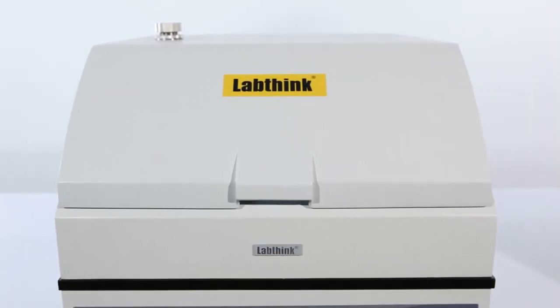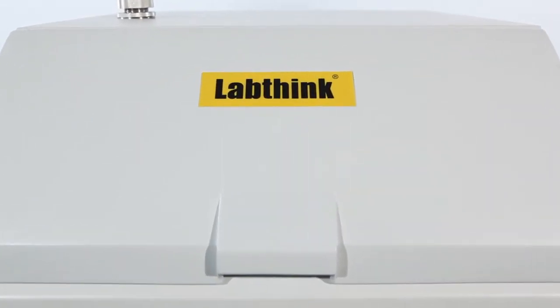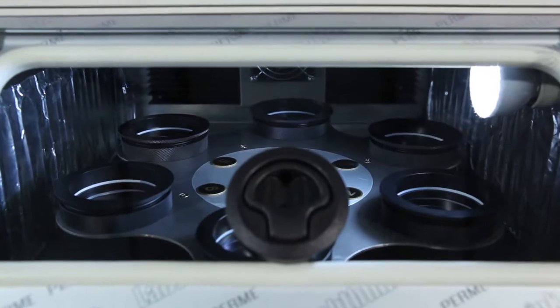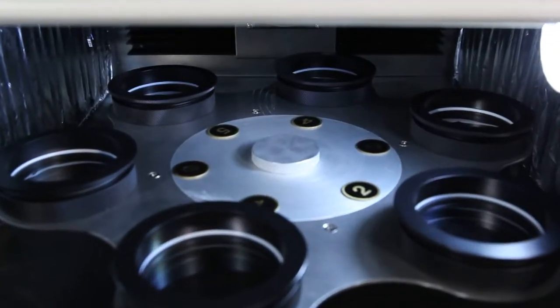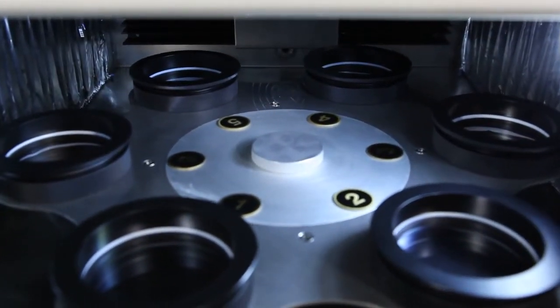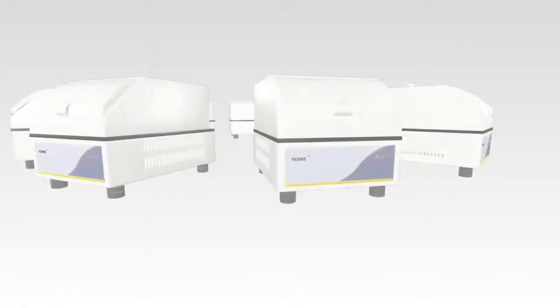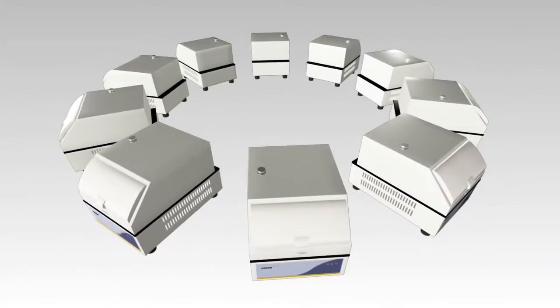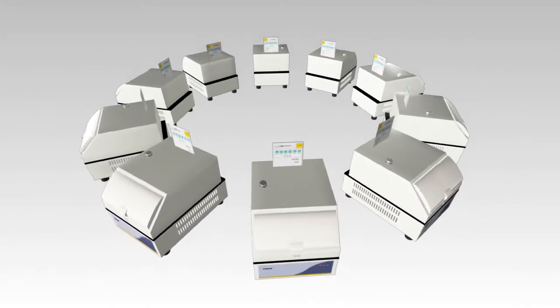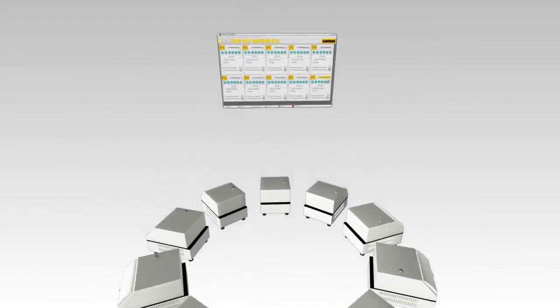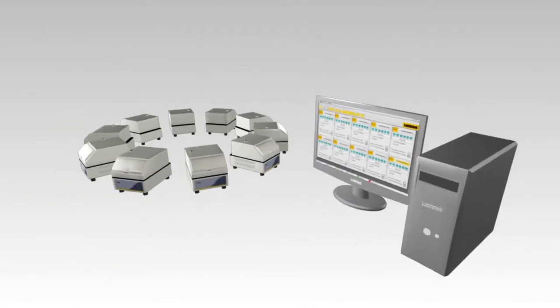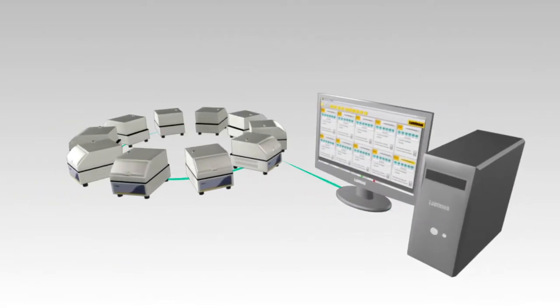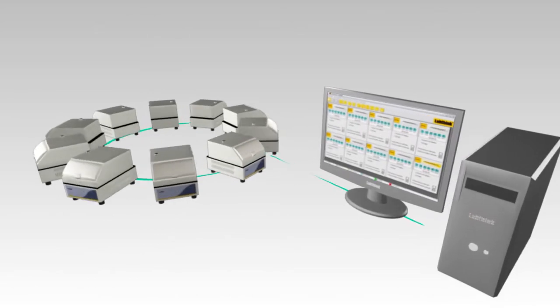The rotary pallet can carry six testing cups in total to measure six of the same or different samples under the same test condition simultaneously. One master base can be easily connected to a maximum of nine satellite modules to accomplish up to 60 independent tests at the same time.